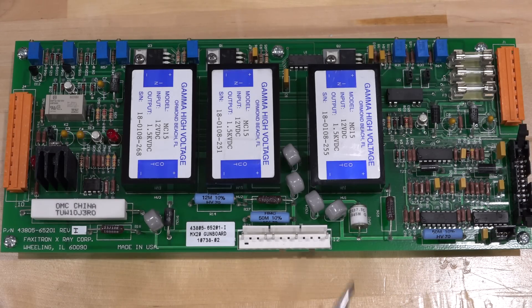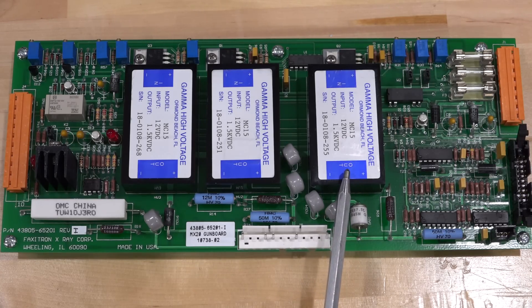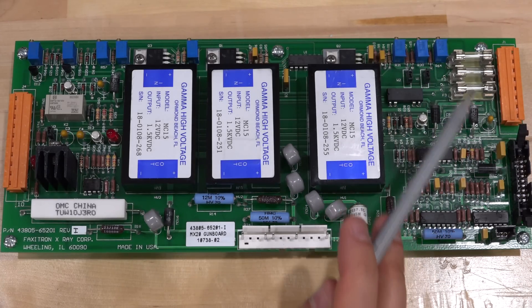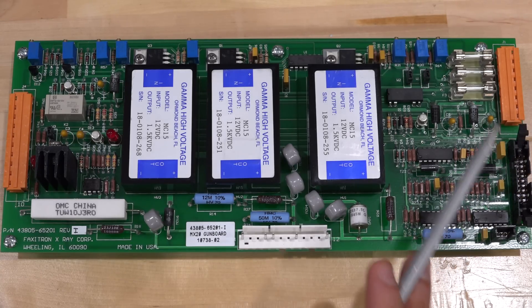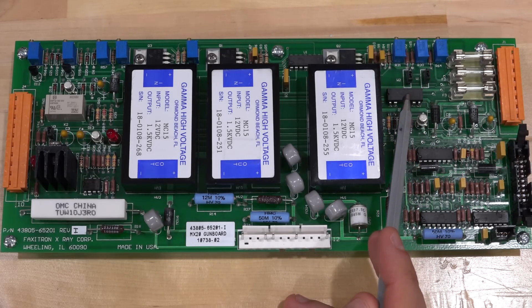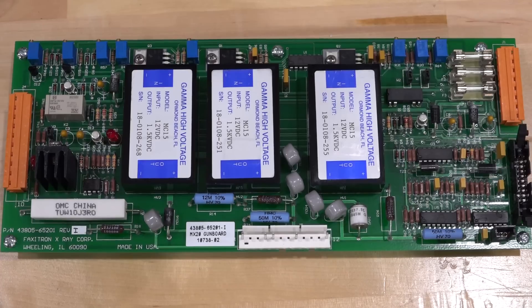I spent some time reverse engineering this board to understand what's roughly connected to what. Since the problem is intermittent, we're looking for things that could be intermittent: broken connections and components, including the high-voltage power supplies on this board. We have voltages from two orange connectors on both sides, some control and analog voltages coming in. There are three GAMMA high-voltage power supply modules — 12V DC input, 1.5 kV DC output — with a linear relationship between input and output, sweeping 0–12V in to 0–1.5 kV out.